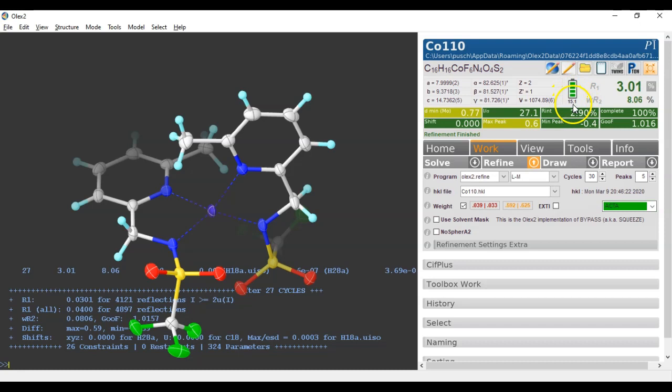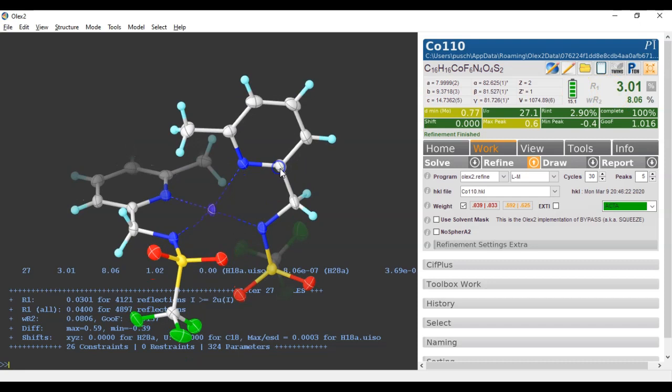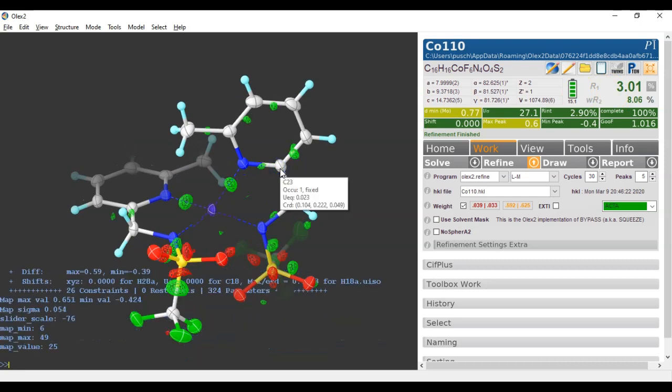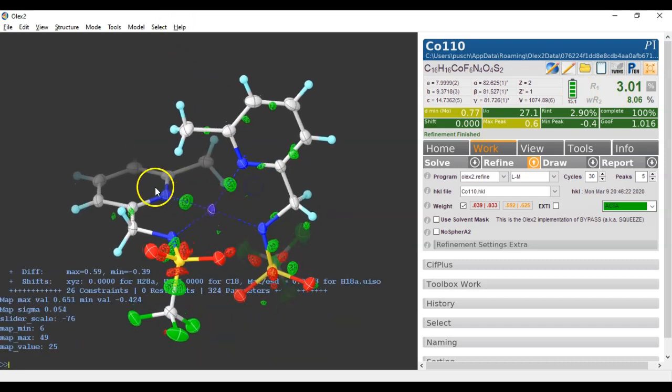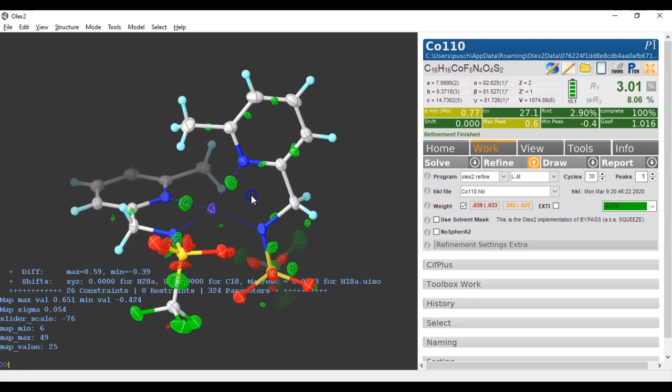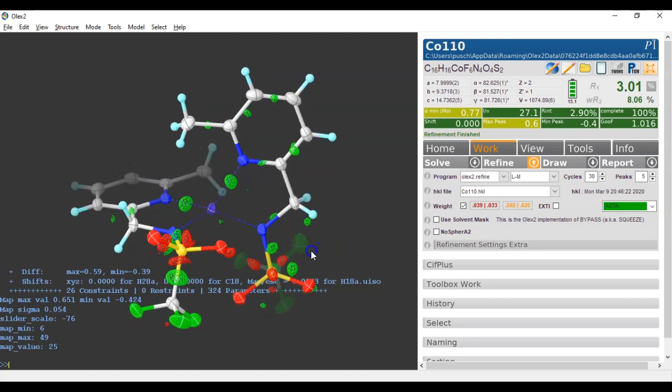And it's gone down to 15. It's not so bad. But the R-vector has gone down quite significantly. But most of all, CTRL-M, the map has now become very clean around this metal and the residual density is actually on the bonds.